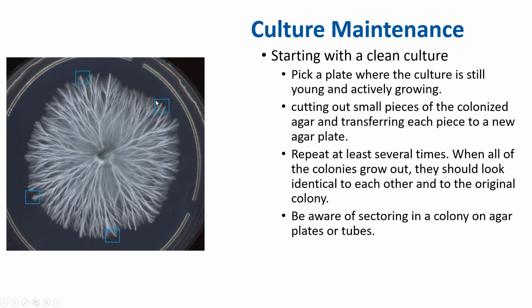But see this square over here, you don't want to cut this giant square. You want to take a little bit of the tip, just this tiny little thing. So this square is just an example of where you're going to target. When you target in here, just take a tiny nick of it. The more media you get, the more chances you can introduce contamination, right?